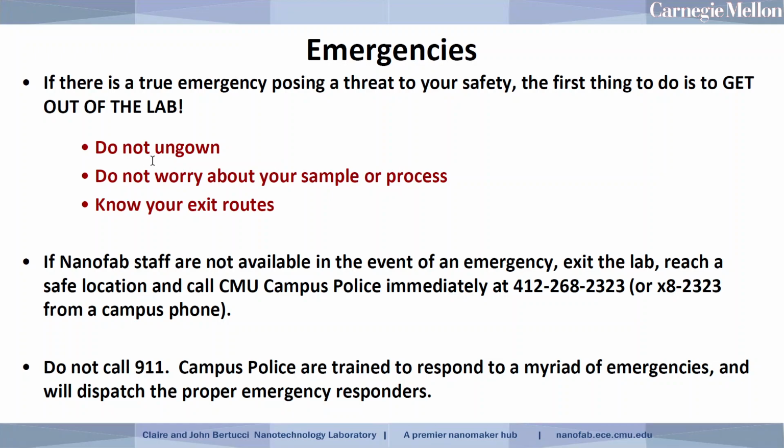We're not going to waste time degowning in this type of situation. You also don't need to worry about the status of your sample or any processes that you're running. So you'll simply leave the tool as it is if you're running a tool, and exit the clean room. And we're going to review some of the exit routes, some of the ways to get out of the clean room and out of Scott Hall on one of the last slides of the deck.